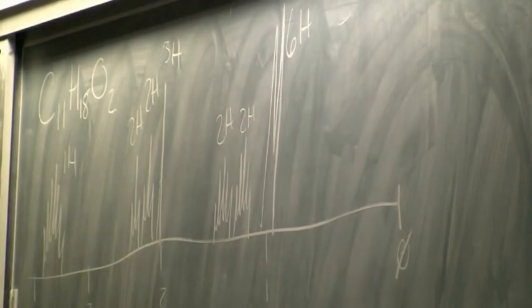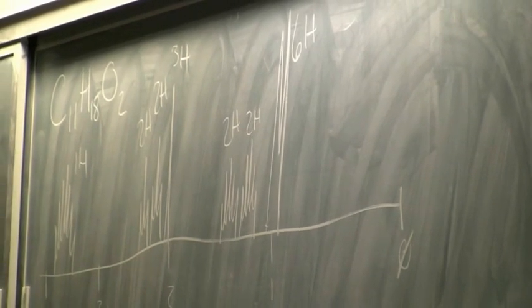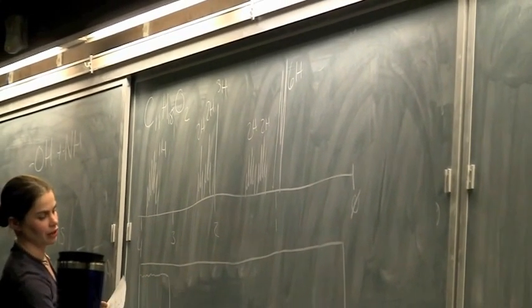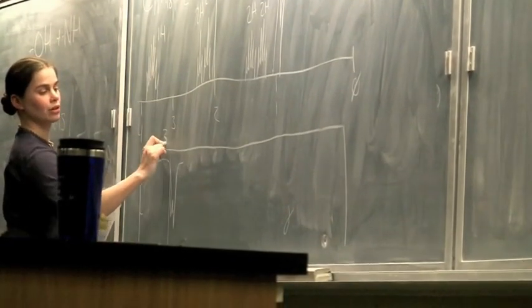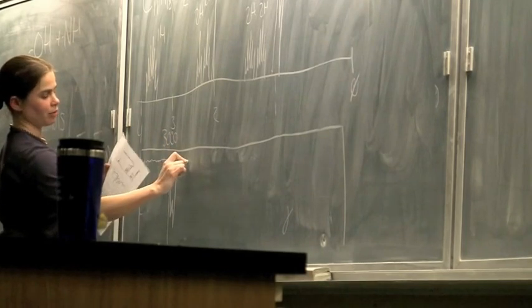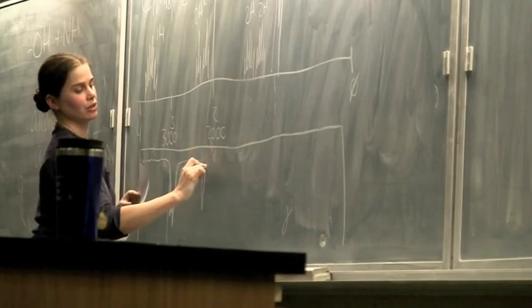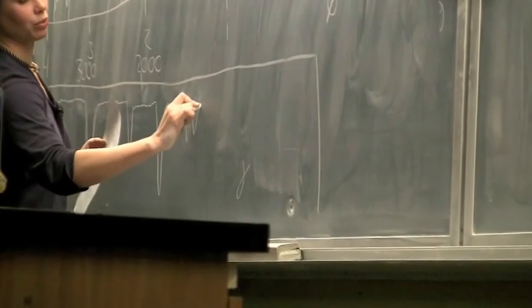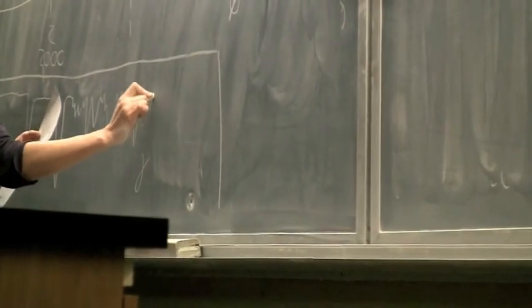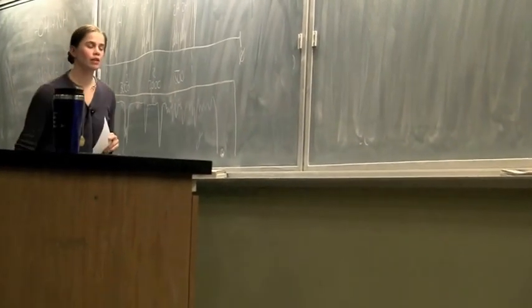If we look at the IR, starting around 4,000, zigzag, nothing much interesting. We see peaks starting. There's our alkanes, right around 3,000. Nothing much, nothing much. Big jump, just above 2,000. Another long peak, and then we start to get into some wiggles, looking at 1,500 or so. There's our IR.